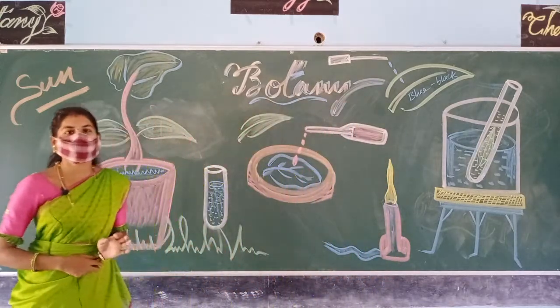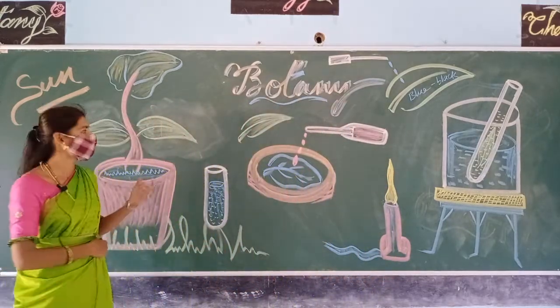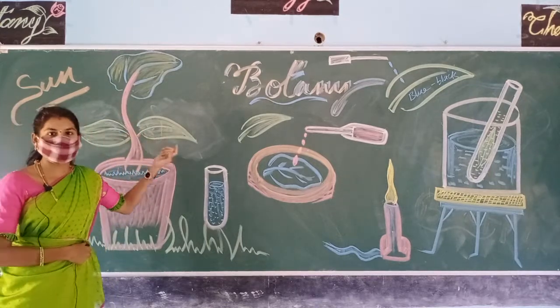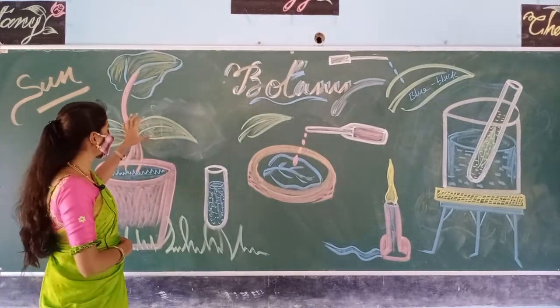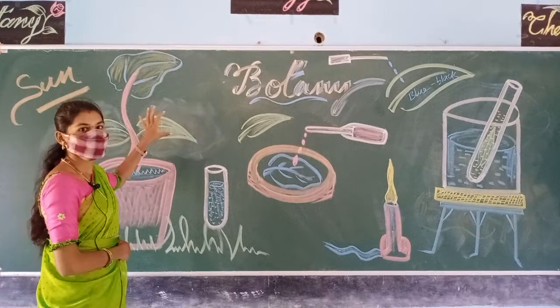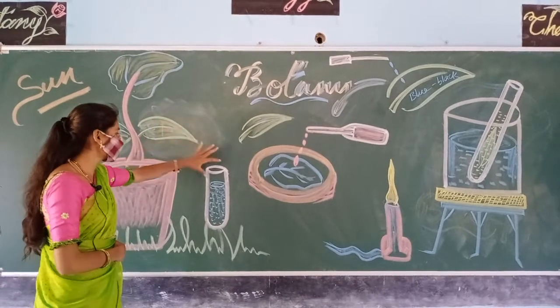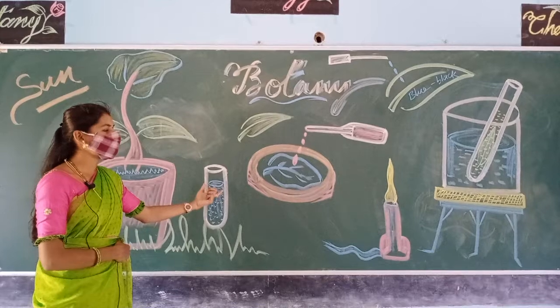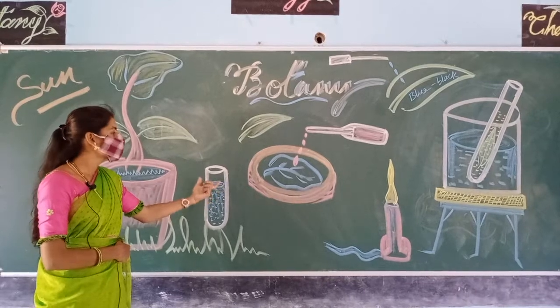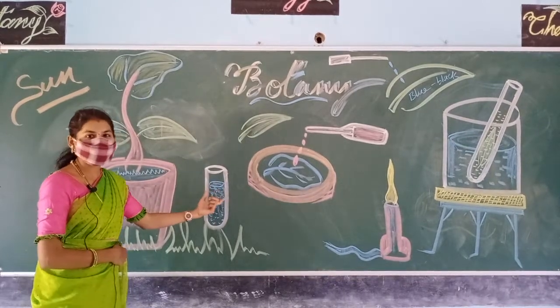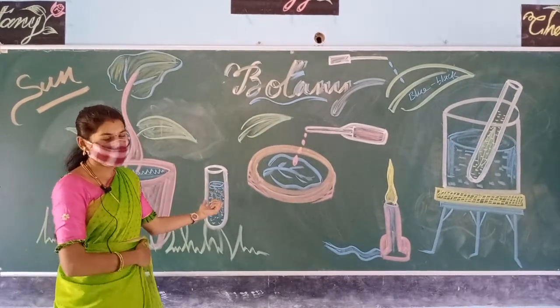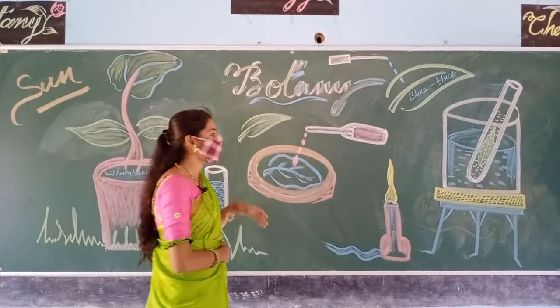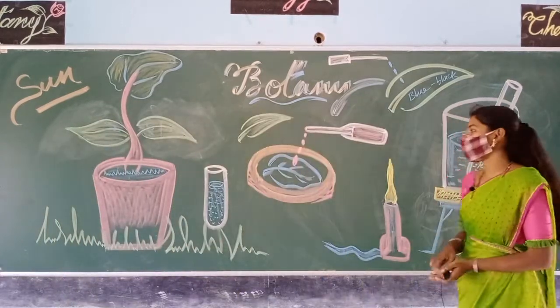First, we need to take a fresh, elongated, mature leaf from a plant. We must take that mature leaf into a boiling test tube, add spirit or alcohol to it, and then keep it aside.